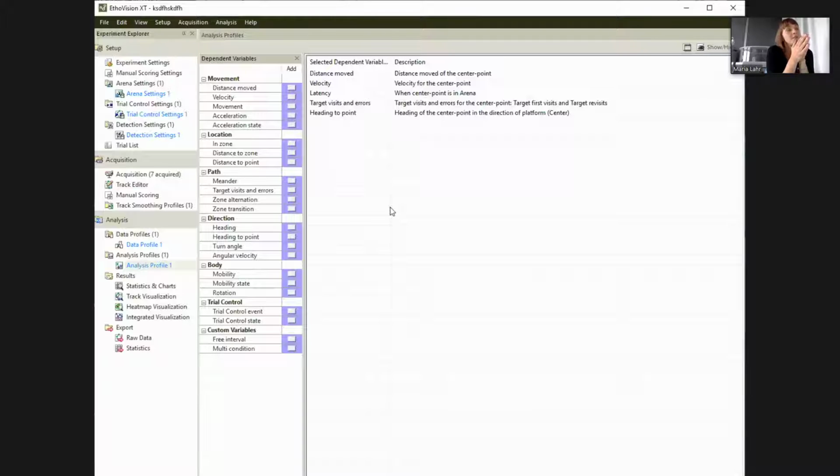And when the mouse swims on the right side or the left side in a certain angle around the platform, it gives us positive and negative values. So it could be the mouse swims like this, or whatever, 90 degrees in the other direction, and you average it, it could be 0, but the mouse has not learned anything, maybe. So you can try to figure this out.